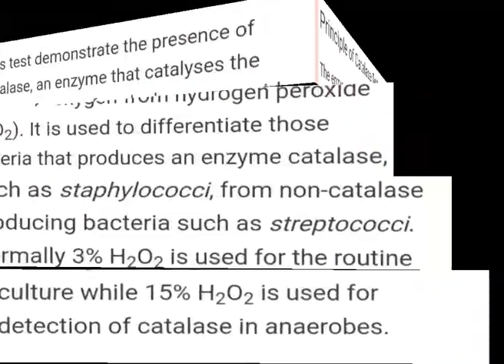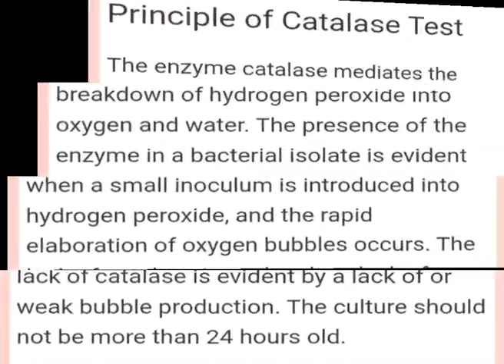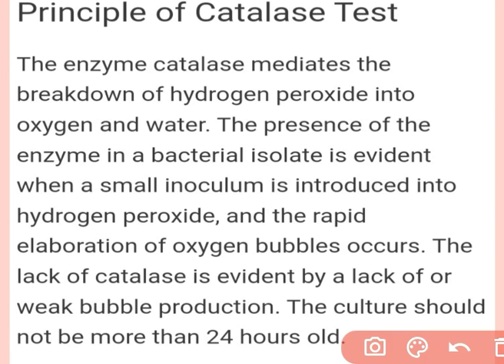Principle of the catalase test. The enzyme catalase mediates the breakdown of hydrogen peroxide into oxygen and water. The presence of the enzyme in a bacterial isolate is evident when a small inoculum is introduced into a hydrogen peroxide solution and there is an elaboration of oxygen bubbles.